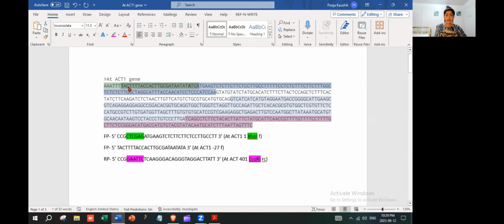And then there are chances that this sequence might have the enzyme that you are going to add in your primer. So if you do not include this site to check if there are enzyme sites in your gene of interest, you are going to add them in your primer, and then later when you will be doing cloning, you are not going to get the correct sequence. When you do the sequencing, you are not going to get the results, and then you might wonder what went wrong. So it is very important that you keep a track of actual nucleotides.